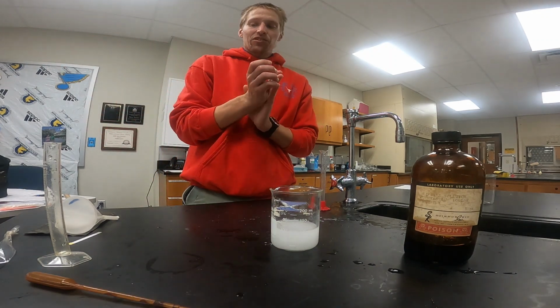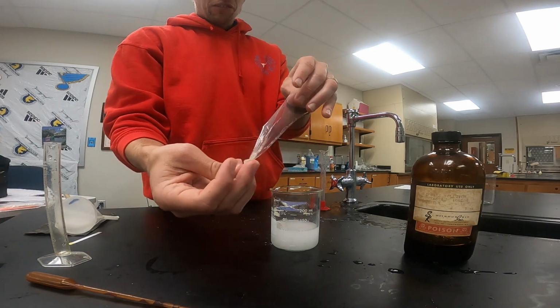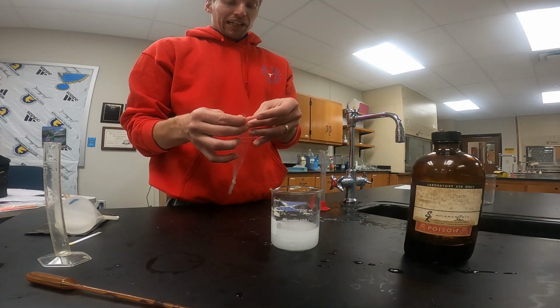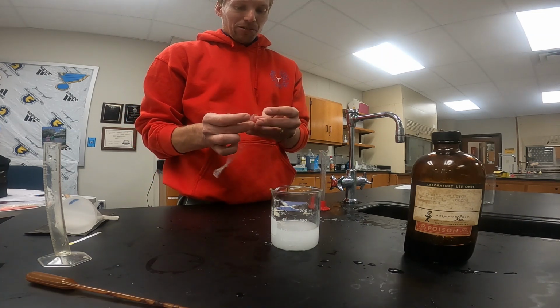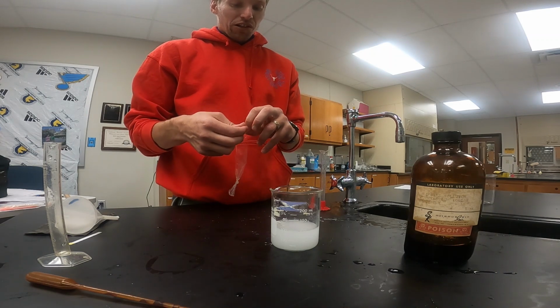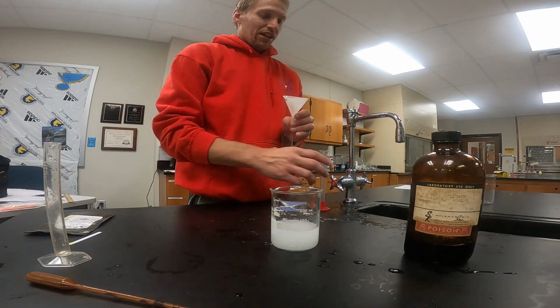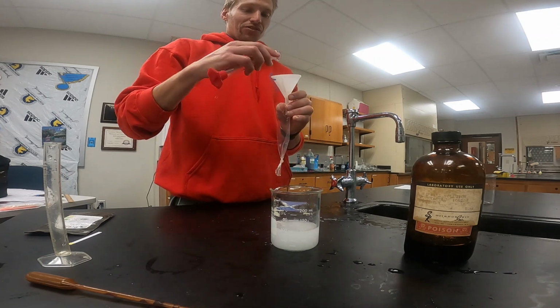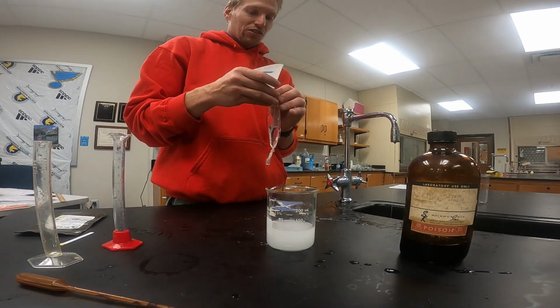And this time, again, we're using a dialysis balloon. I've already started this one, and we've already tied off the bottom. We just have to open up the top, put a funnel in, and inside this balloon, we're going to put in 10 milliliters of water. You can use distilled water or tap water. They're both going to give us the same result in this case. I've already measured out my 10 milliliters, and I'm just going to pour that in. So we have our 10 milliliters of water in the bag.